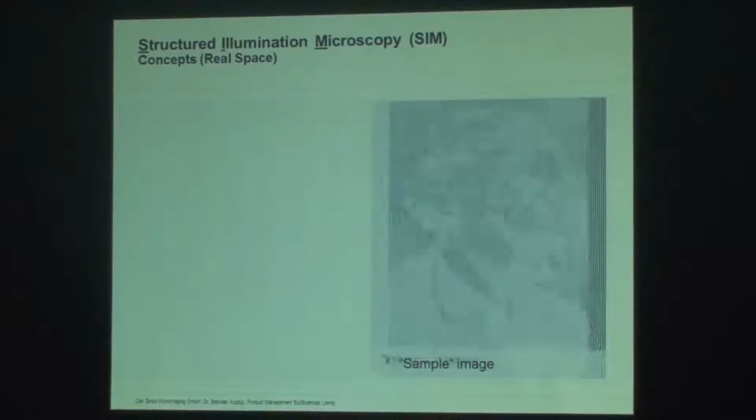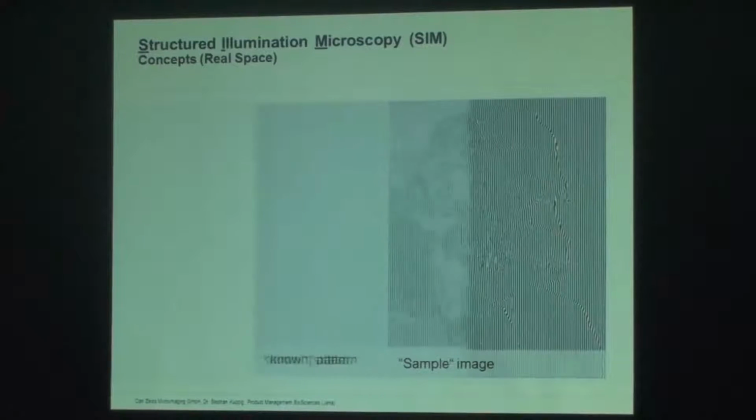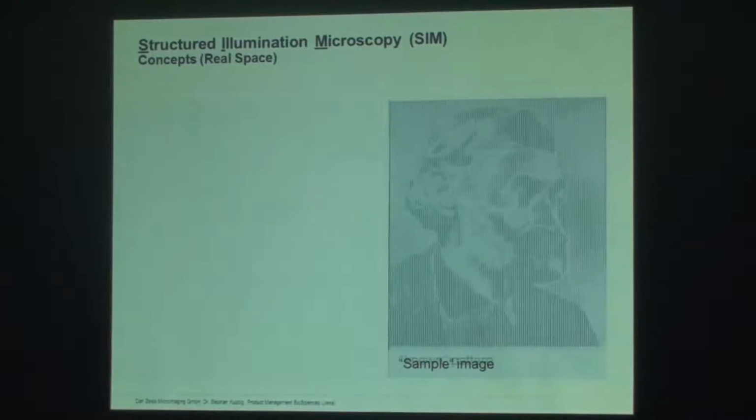So this is another example of how different intensity of the structured illumination can also reveal the high frequency information which is hidden in an original object.